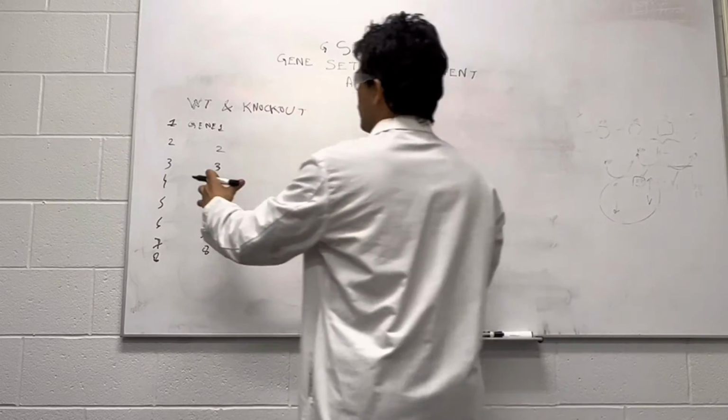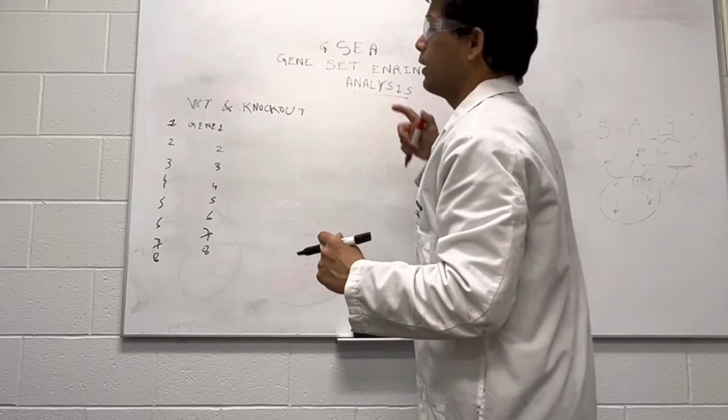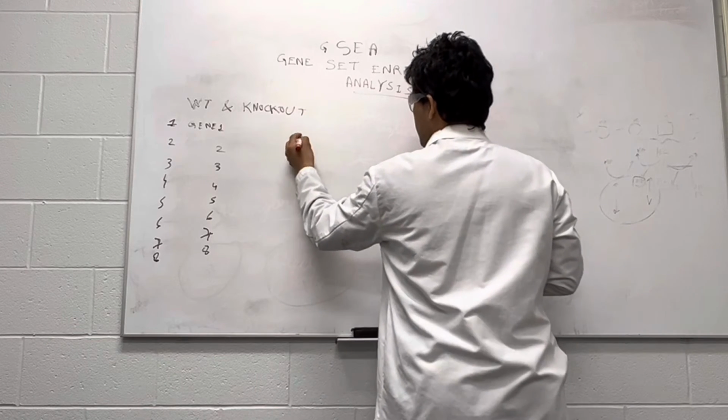And when we have these two different samples, what we do in GSEA first is to prepare a ranked gene list.